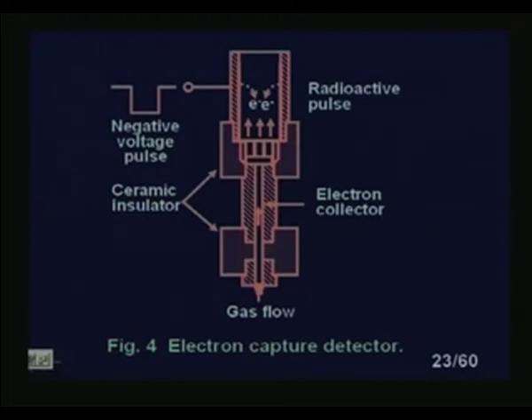and reduce the steady state current, thus providing an electrical reproduction of the gas chromatography peak. Of the two general designs, the plain parallel and the concentric cell, the latter design is preferred, since it is easier to construct a small, low volume cell in this form. Now, the particular radioactive sources which are used are tritium adsorbed in titanium or scandium, and nickel 63 as a foil or plated on the interior of the cathode chamber.